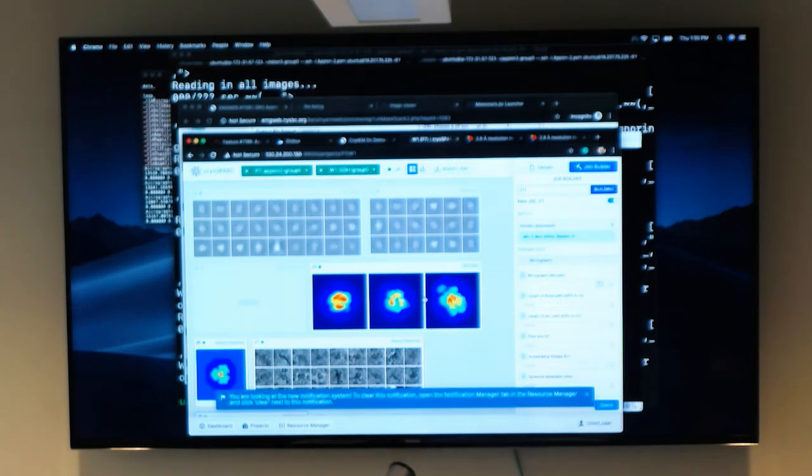And here, since it takes a long time, I saw you have already made a model. Yeah, so if you want to skip ab initio, then we already have a model that you can implement. We don't have to wait. We can run it first and see if you get three, or you get one.